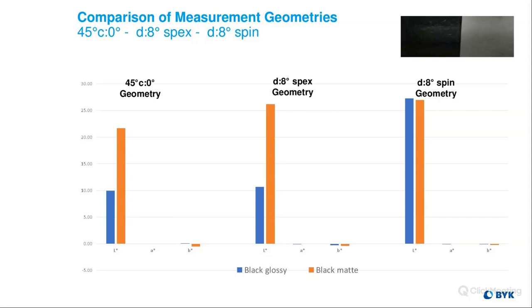I would just say a lack of understanding of how the instrument actually works could play a role in not understanding some results that you get. Because we're dealing with very accurate instruments, and it gives you all these values, and sometimes it gets a little confusing with all the values, and you're not sure what's actually being read to you. Gotcha. So just have a clear understanding of what the instrument does and how to actually analyze and report on the data it produces. Right.